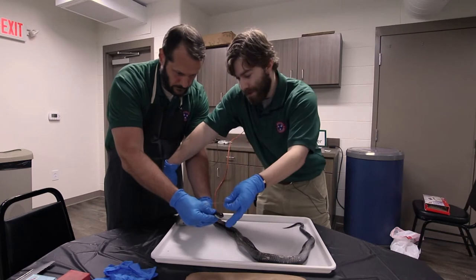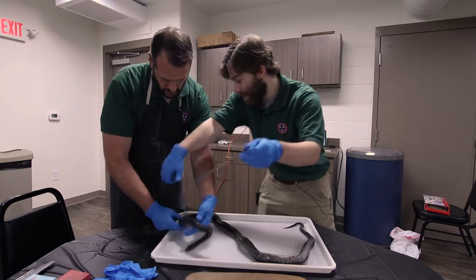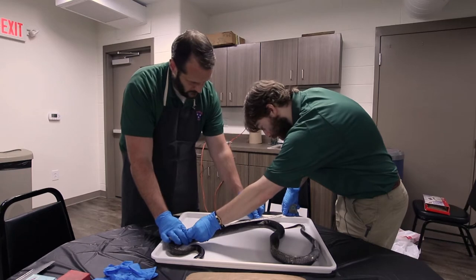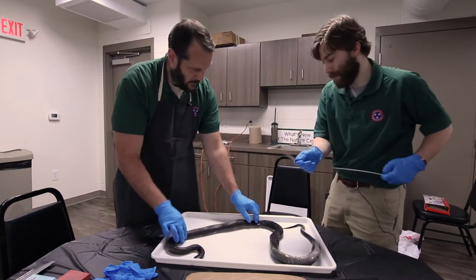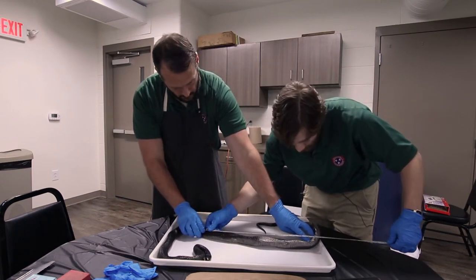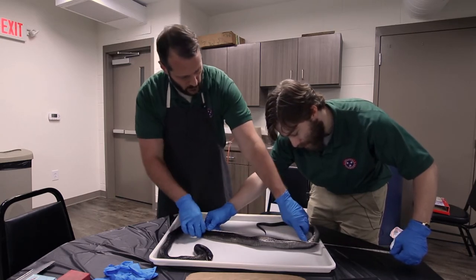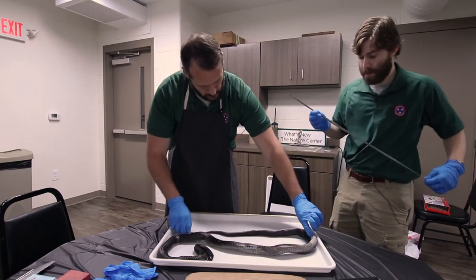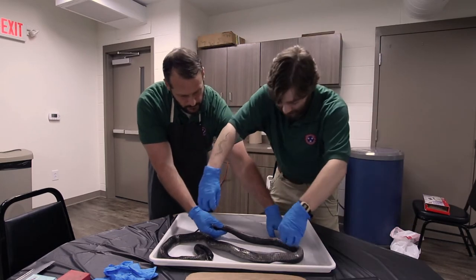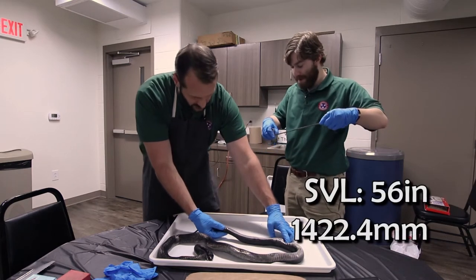So we'll do this long section here. That's 16 inches right there. Okay. I'll start from there. 14. Okay, that's 30, right? Mm-hmm. 40. So that's another 16. So it's 46. Oh, so we're just going to the vent? Yes, this will be the SVL, the snout vent length. Okay. That's 10, so 56 inches.